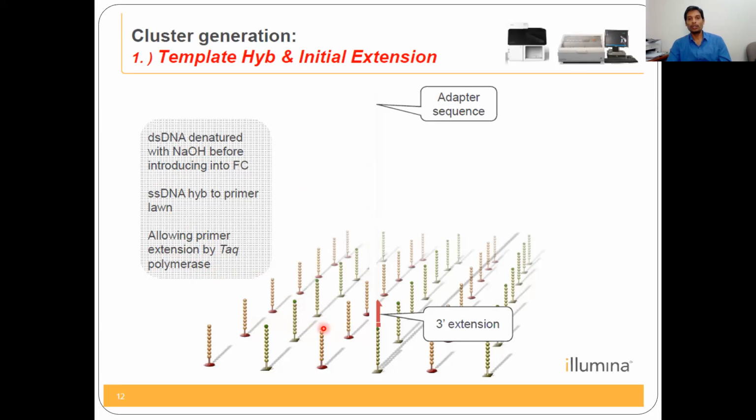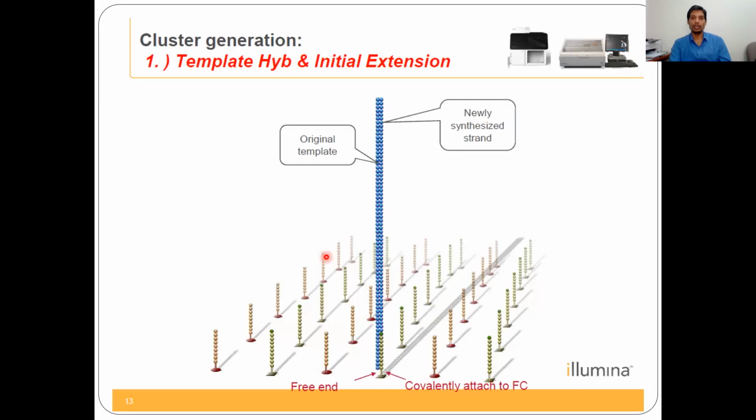Okay, so after that, what are you going to do? We are going to add dNTPs and DNA polymerase so that it will go and extend. So this is how the step by step works. Okay.